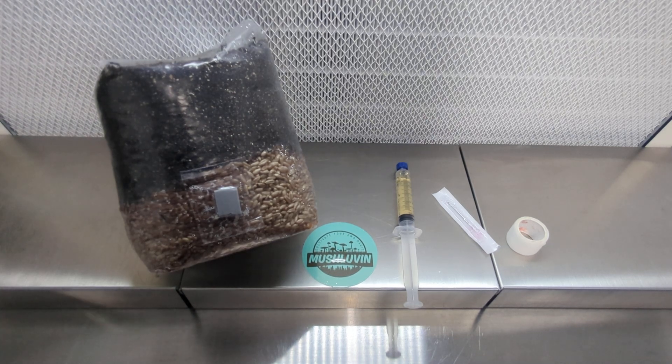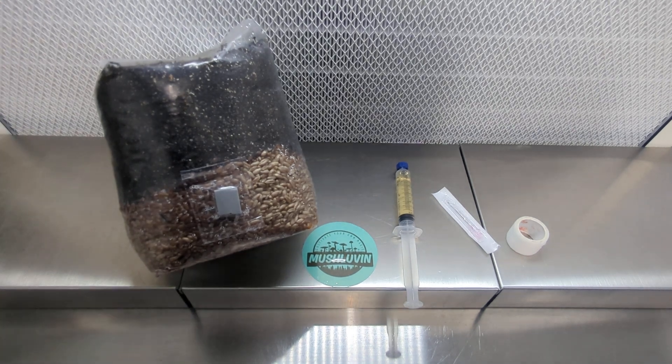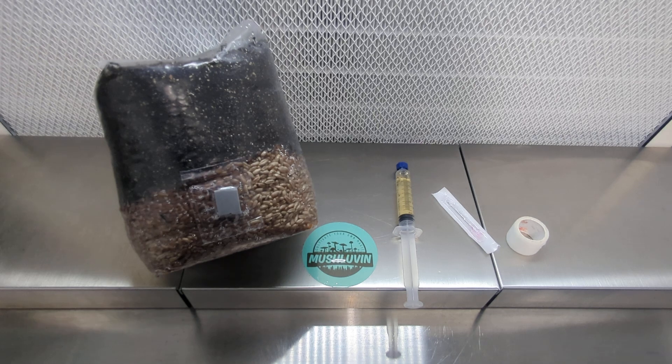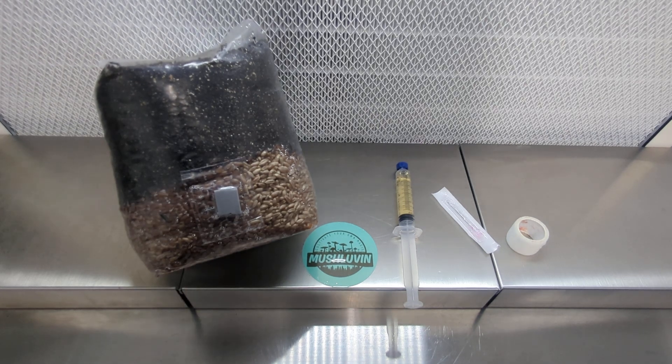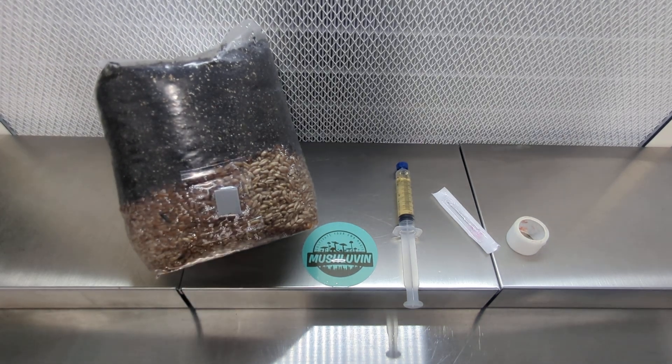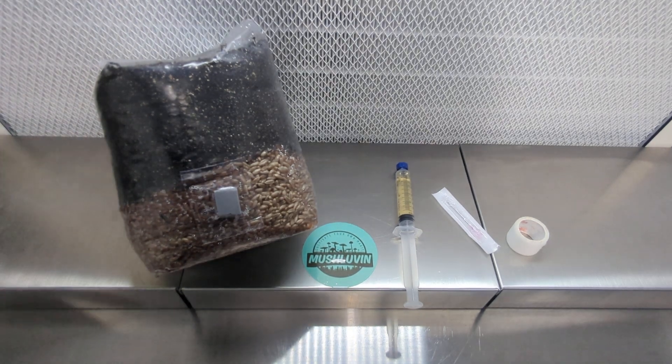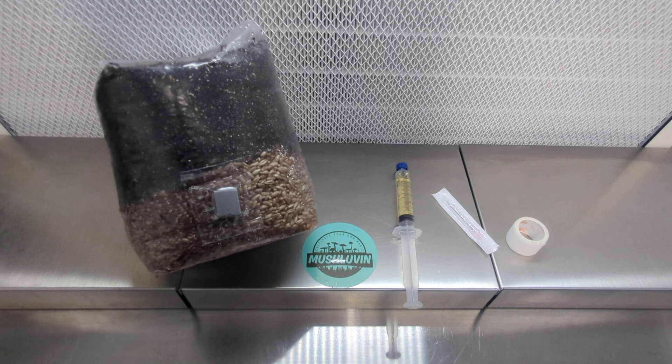You don't have to use a flow hood. You can use a still air box which you can build yourself or buy online. If you don't want to go that route you can always work in a bathroom. Again you'd want to turn off central AC and any fans for at least one hour before working and wipe down the countertops really well with 70% isopropyl alcohol.